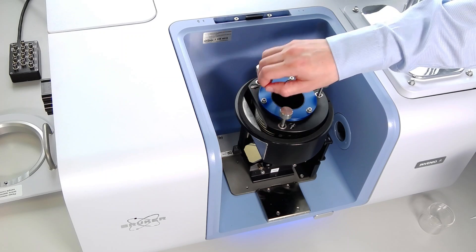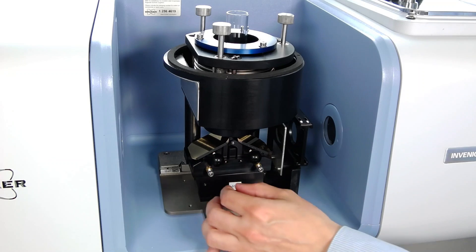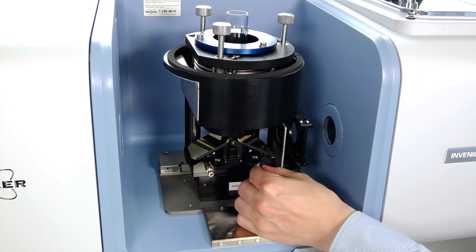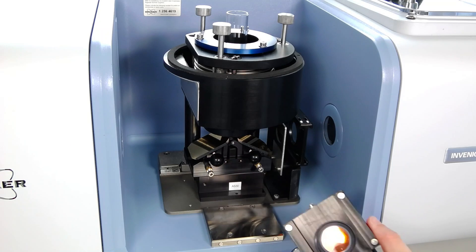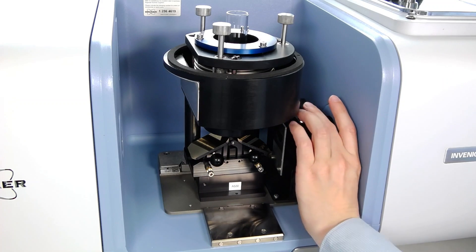It is possible to adjust the mirror by plus or minus five degrees to realize different angles of incidence and to improve the optical alignment. The alignment and signal intensity can be controlled live in OPUS in the check signal tab, where you can see how the signal channel intensity increases. At the right side of the reflection unit there is an additional slot which allows for insertion of additional polarizers or filters.